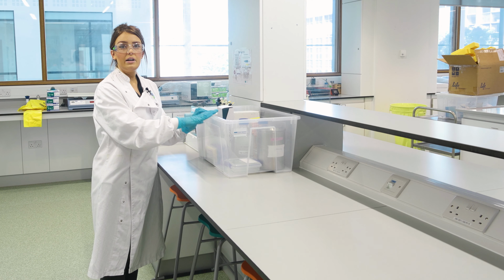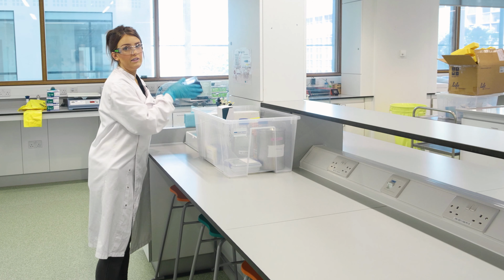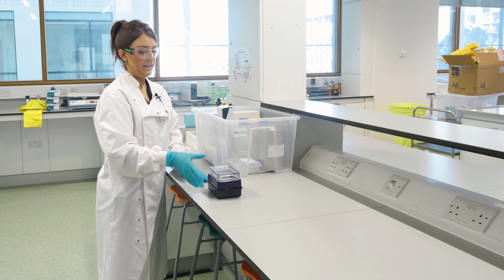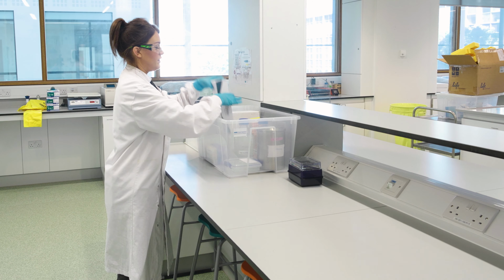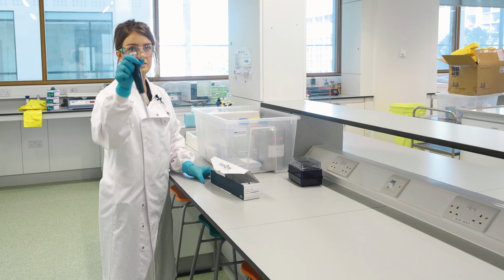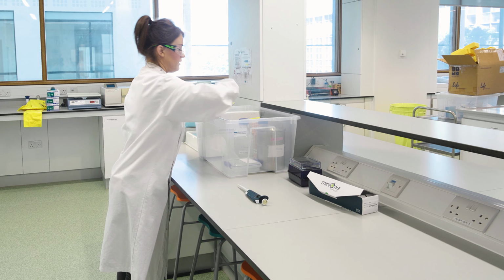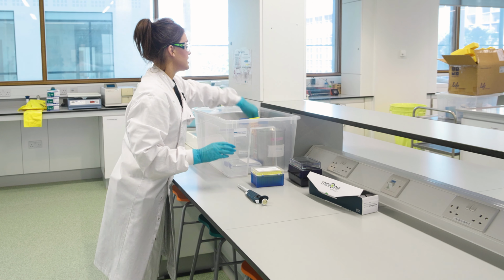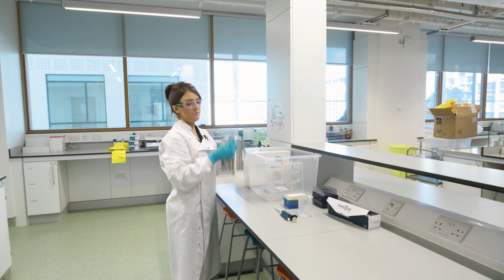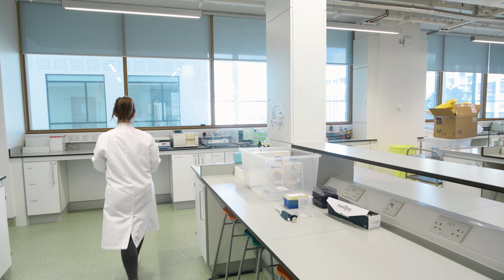So for this lab, students will be in groups of 3. So per each 3 students, you'll give them their DNA samples in the blue cooler box, which will be in the freezer until you need them. You'll give them a P20 pipette that will be set to 20 microliters as such. You'll give them a box of tips and a small waste beaker. And at the end of the class, all the waste beakers will go into this waste beaker with the lid. You can also leave this at the top of your desk.